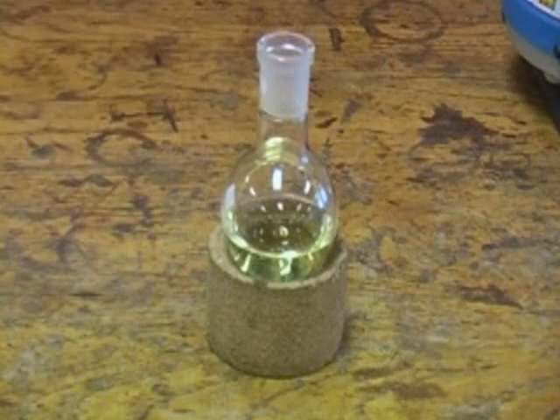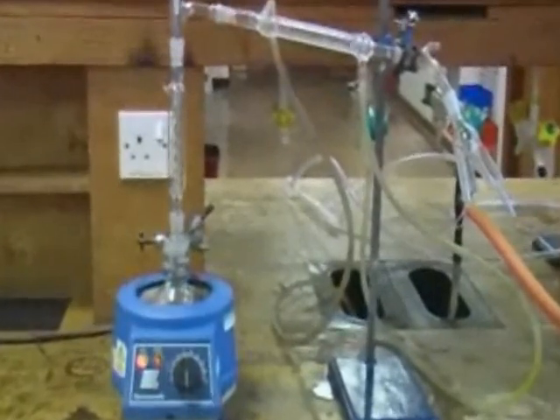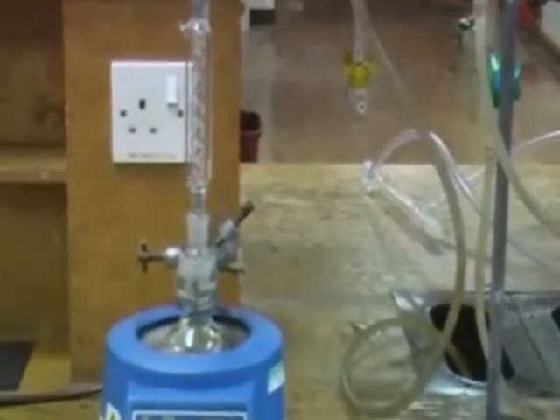This is the distilling flask which contains our mixture of liquids. This is firstly clamped into a heating mantle. We then place a fractionating column into the neck of the flask.